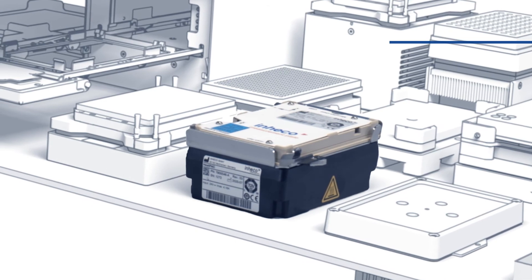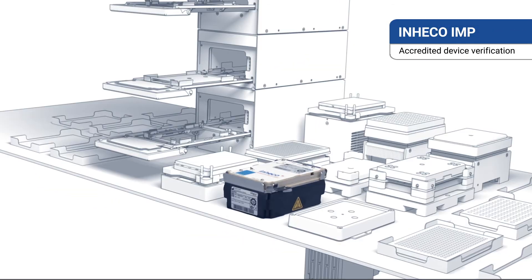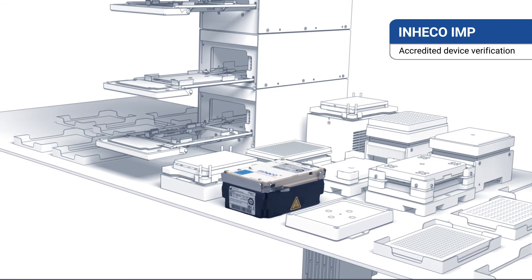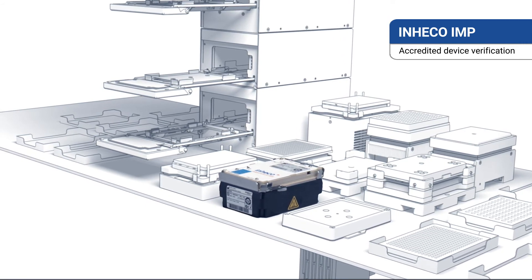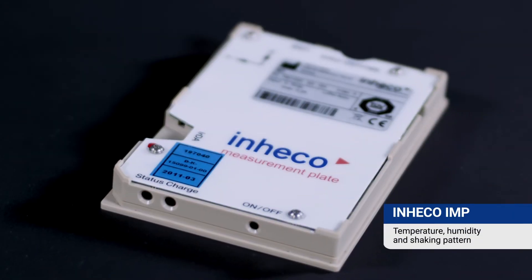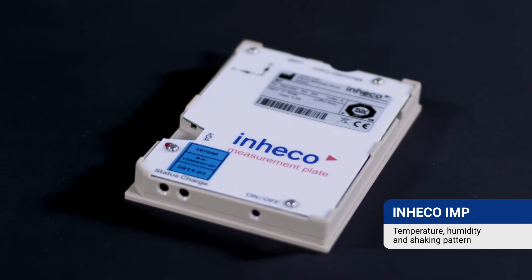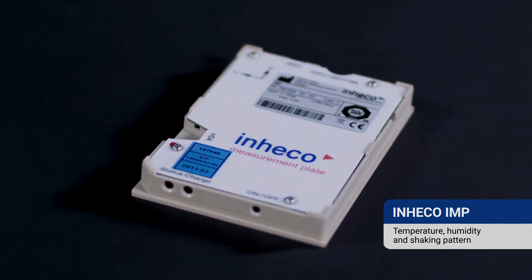For scenarios where long-term consistency and accuracy are critical, INHECO provides a stand-alone verification tool, enabling users to monitor and measure the performance of our devices. Our INHECO measurement plate IMP enables wireless verification of temperature, humidity, and shaking pattern.